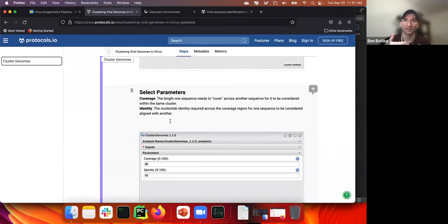And it will affect your abundances because Bowtie or BWA is going to have a hard time if you have 5 of the same sequences that you're mapping against. And so you want to make sure that when you're talking about a single unit, it's the same species or the same viral population, or basically the same genome.